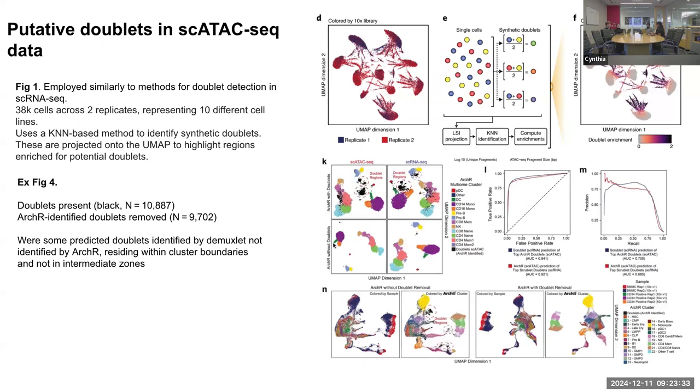After removing these, they can denoise the data in some way. This is interesting because it is a way to handle data where it is difficult to have a clear clustering definition, so we cannot touch the biological signal. Probably this can work.